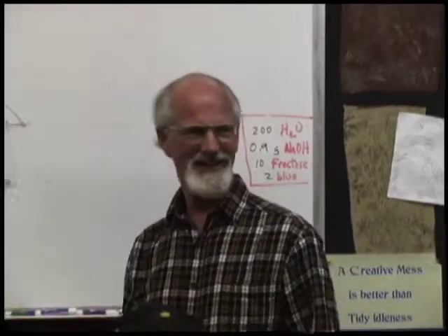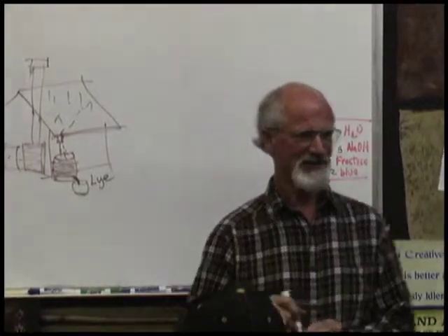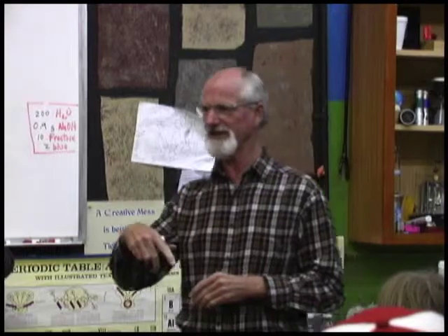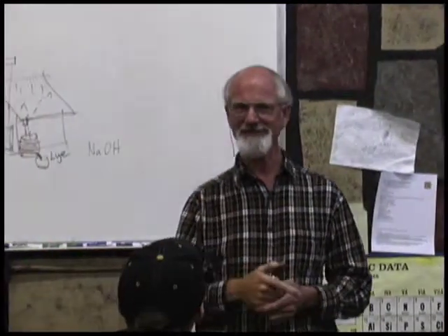Except it takes the skin off? Yeah. Does it really take your skin off? Oh yeah. So, when we're using lye or any strong chemicals, you want to be kind of careful. So today we're going to learn how to weigh it, how to dilute it, what happens when you dilute it, and then we're going to create an experiment with it.